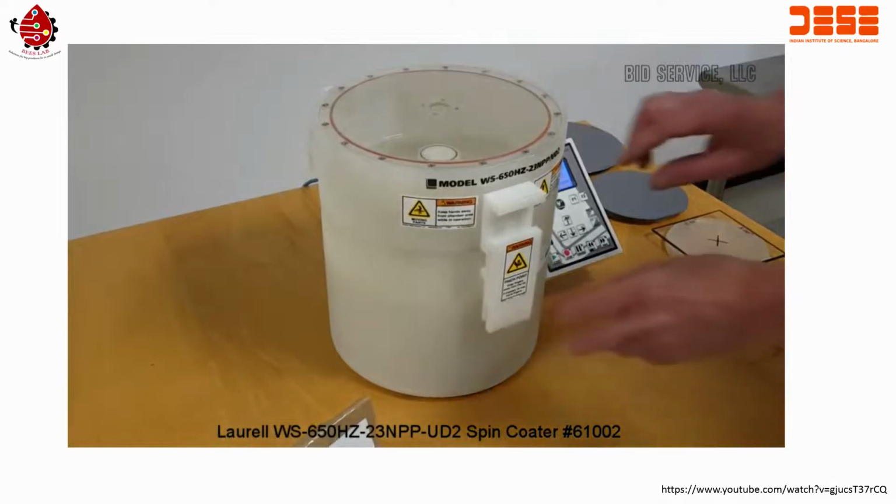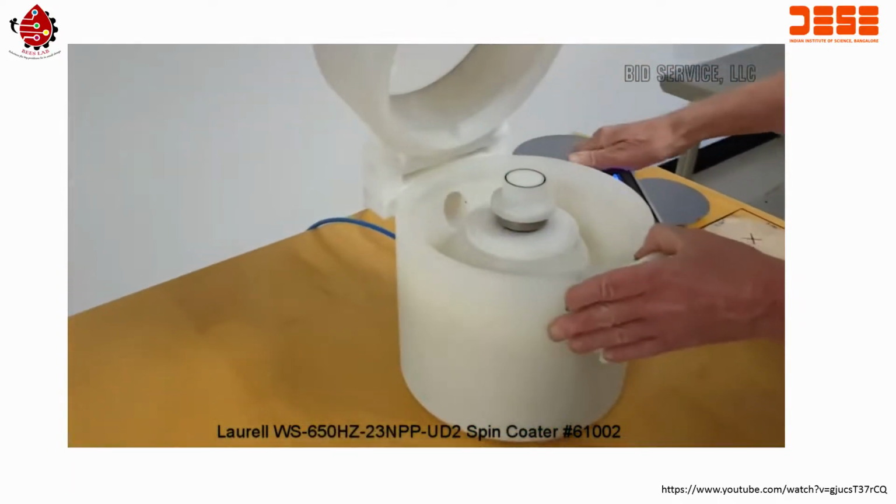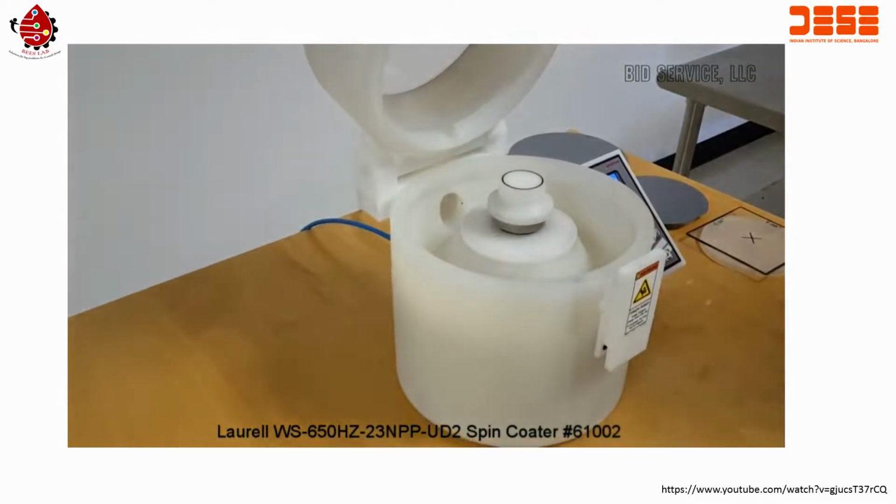First, I'd like to give a demonstration of the speeds. For that, I'm going to use our little timing strip.